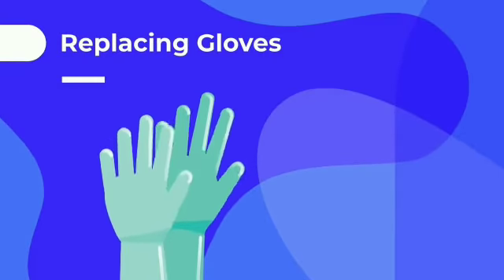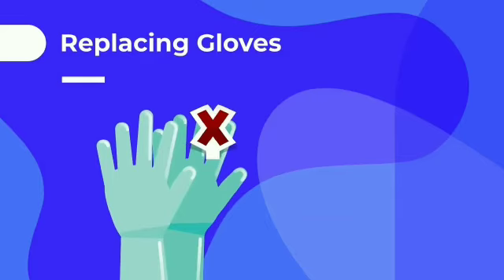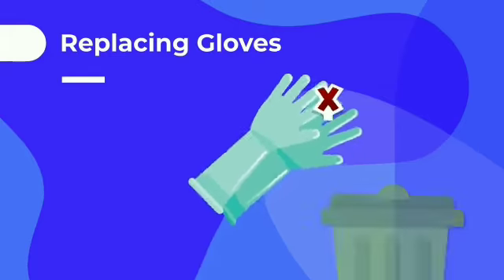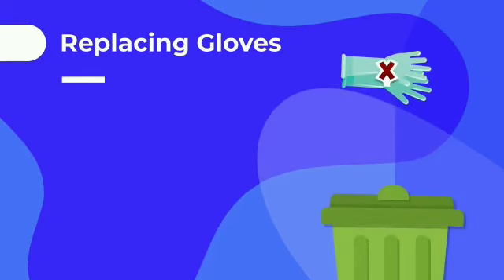Gloves should be replaced as soon as possible if they are punctured or torn, and their ability to function as a barrier compromised. Gloves should be changed between procedures and always disposed of properly.